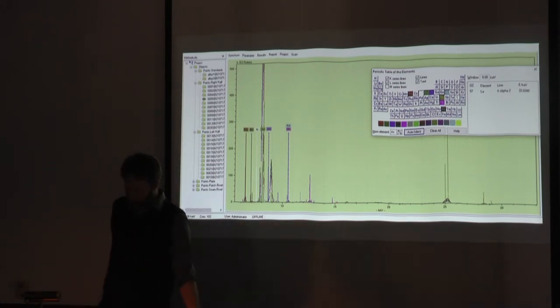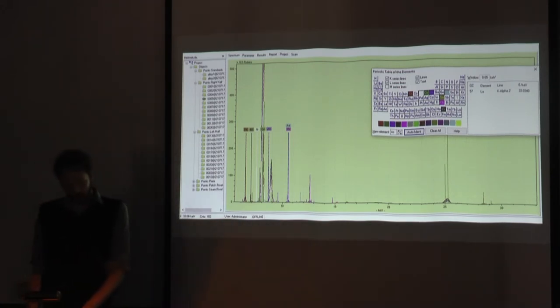The primary interpretive methodology that we used to understand our data was to calculate and compare total photon counts. Using the RTAC software, which is a more general XRF program, we identified each element in our 30 spectra. Based on the elements we identify, RTAC cancels out all the background noise and produces total photon counts for each element. On their own, these photon counts don't really tell us much. There's just way too many background variables.